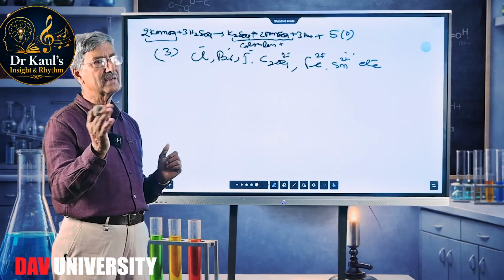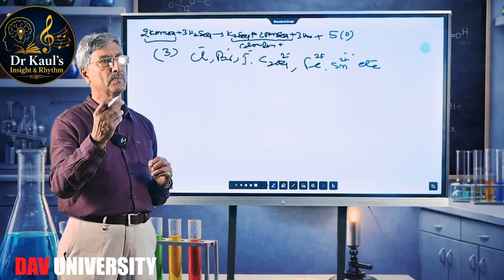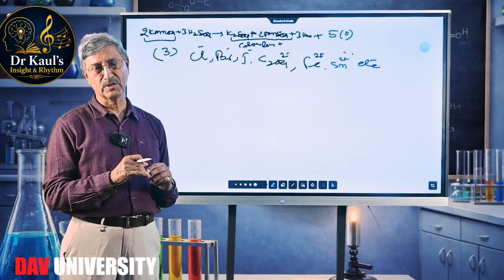So with that, we'll be completing our series on analysis of acid radicals in a salt mixture.